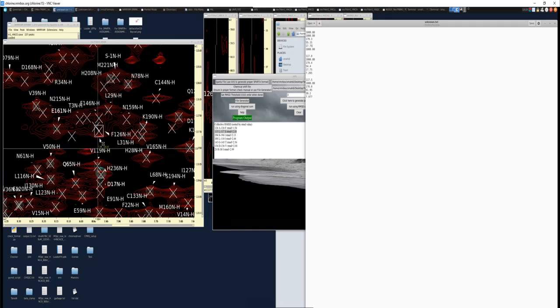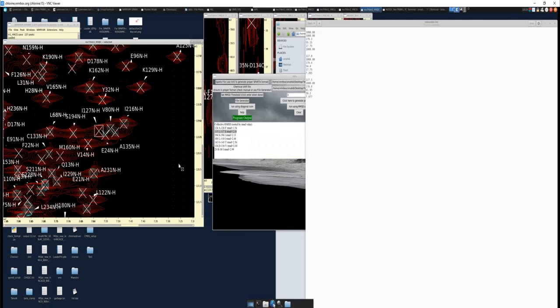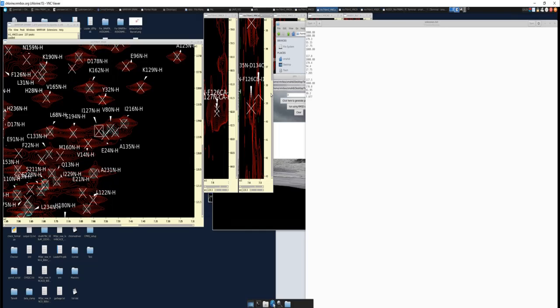So say you find the I+1 of this. You run another strip plot, and you find the I+1 of this amino acid. Here we again continue the cycle. Nitrogen value first, 119.3. The alpha hydrogen we don't have, so we put 1,000.